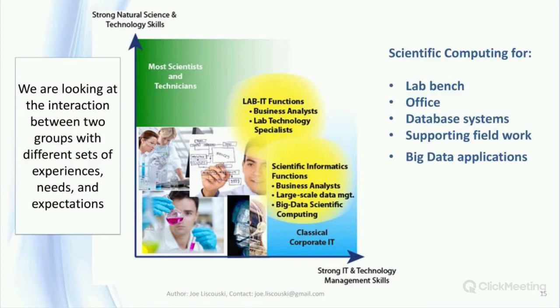In some cases, it was the use of quality control results to provide more timely input into production and solving product quality issues. Researchers began to take advantage of it in large-scale modeling and statistical applications, and we saw the arrival of big data applications. All of this put more importance on streamlining lab processes and moving data and information into places where people could take advantage of it.